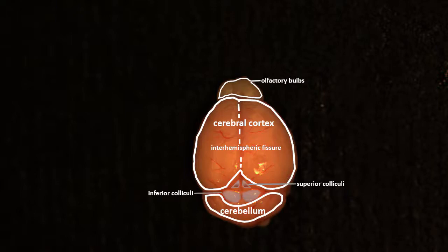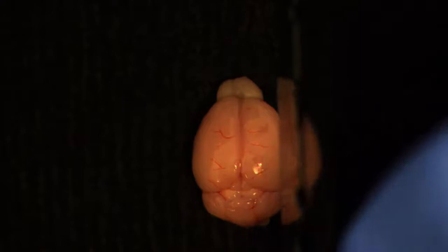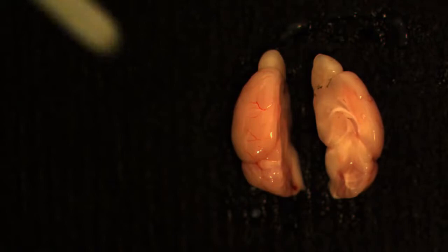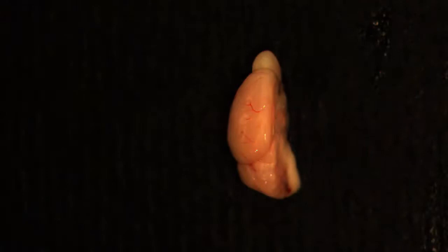Place a scalpel blade perpendicular to the plate and cut through the entire midline of the brain, following the groove of the interhemispheric fissure. Then gently pull apart the two brain halves. You can then dissect each half in parallel, or you can do one after the other. Here I will dissect the left half first and then go on to the right side.